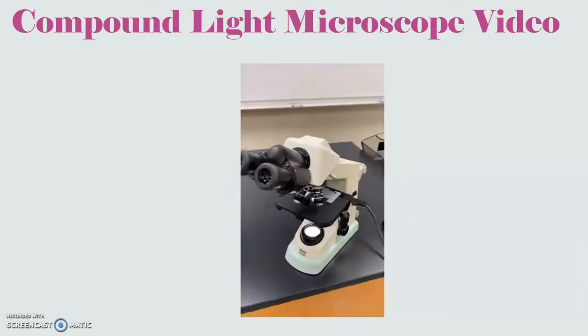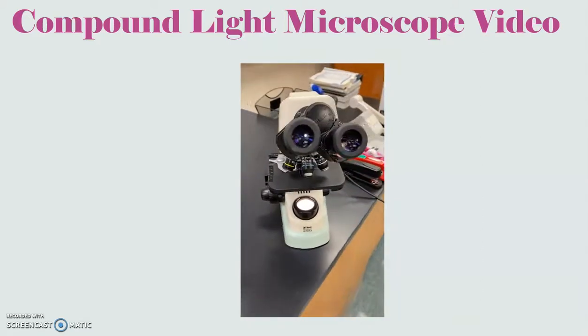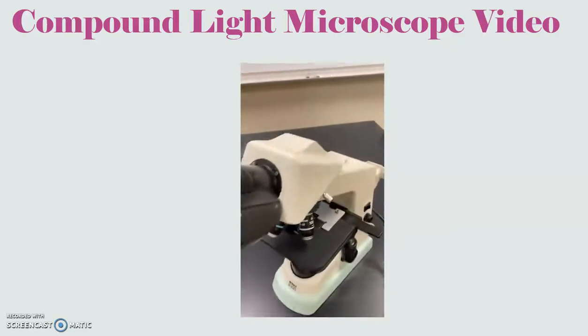That is your microscope, your compound light microscope used for TCC anatomy and physiology science labs.